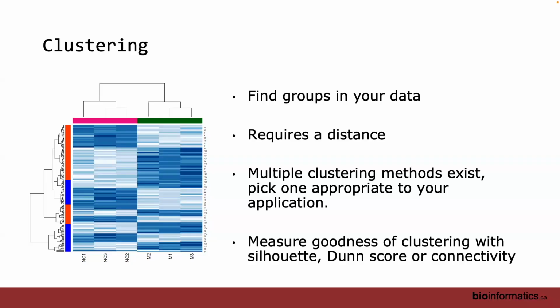For single cell, I've seen the field does different things. You can measure silhouette index, but I've also seen people, when you have a big single cell data set and there are like 40 clusters, plot the cells in each cluster one by one, using a combination of visual inspection and tools like Clustree.